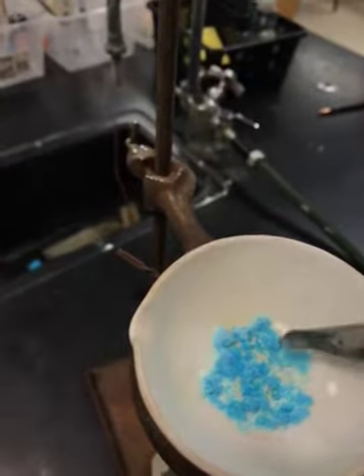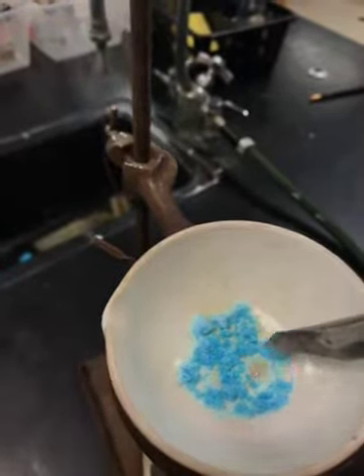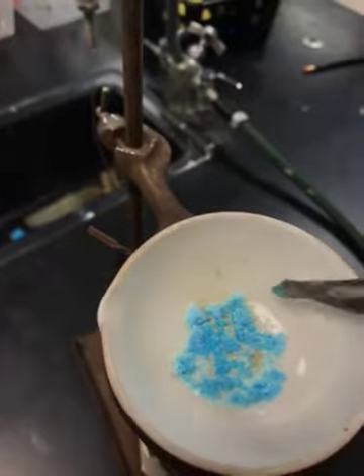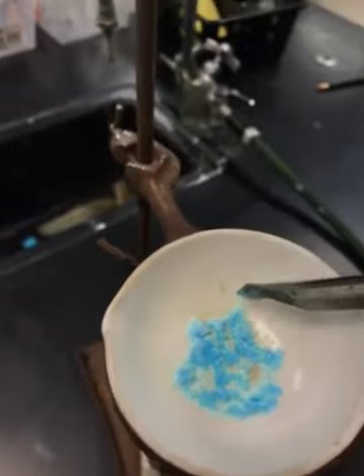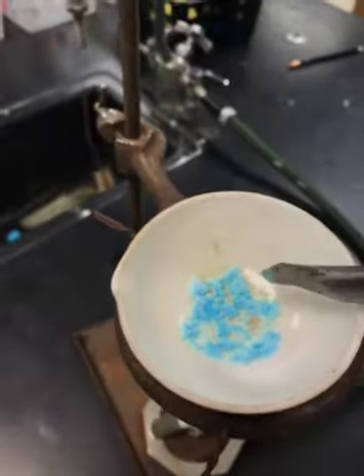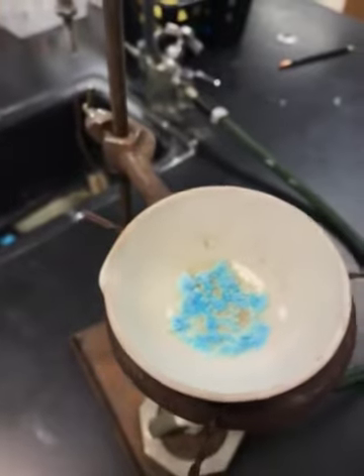When it's hydrated, it turns blue. So I don't know if you can see this, but the parts that are starting to dry here are turning to a lighter color. So I'm going to continue to heat this for 5 minutes, and then I'm going to let it cool for another 5 minutes, and then we're going to mass it together.